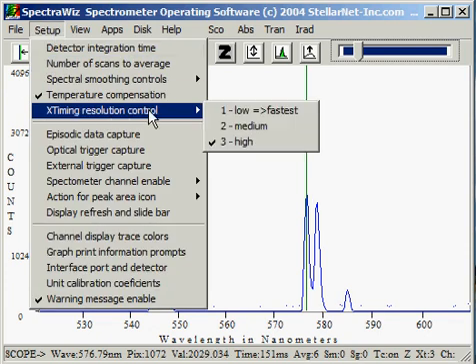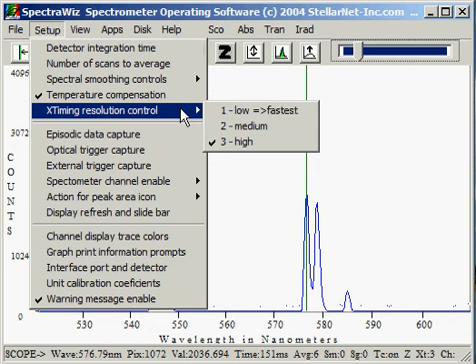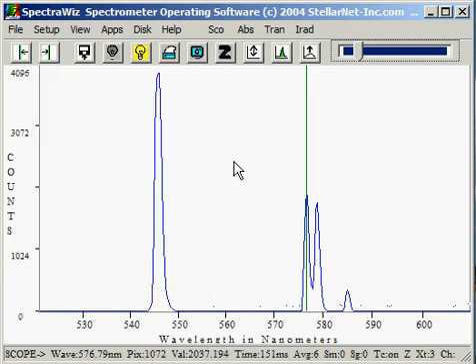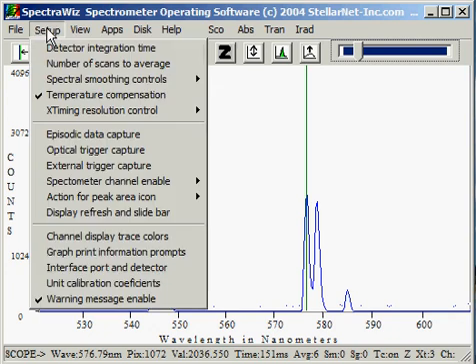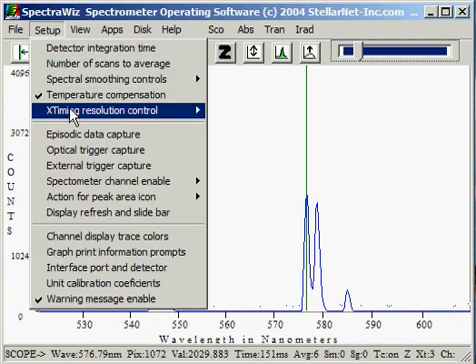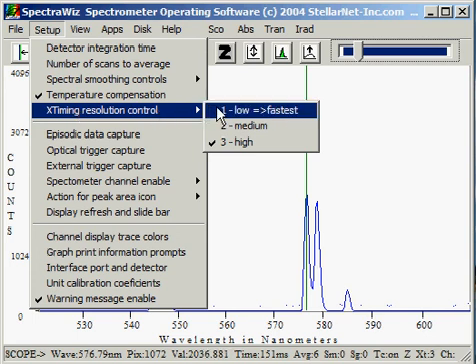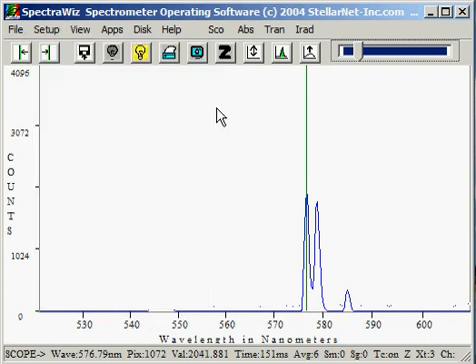Resolution control is a feature that StellarNet provides to get the highest possible resolution out of the spectrograph. We currently have it set at high. Changing this setting to lower levels allows the digitizer to perform in a more expeditious fashion.